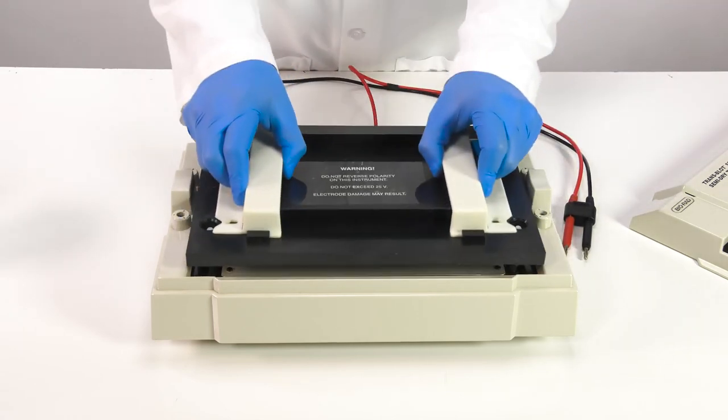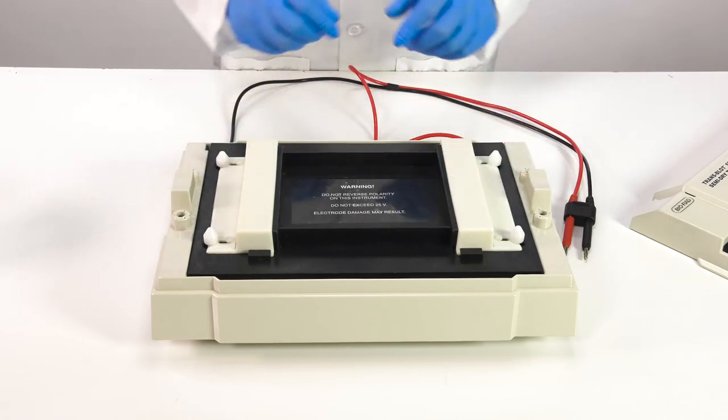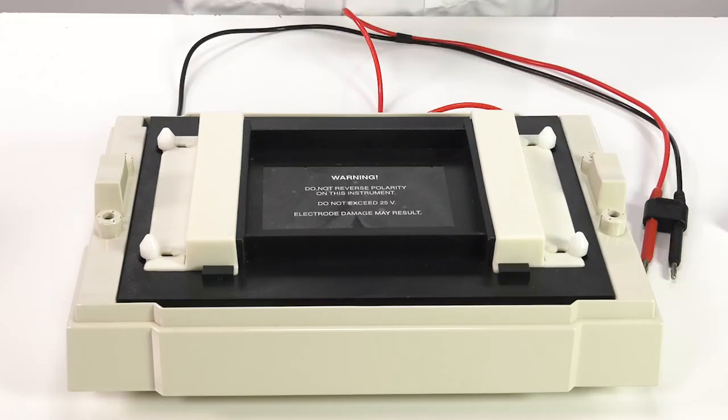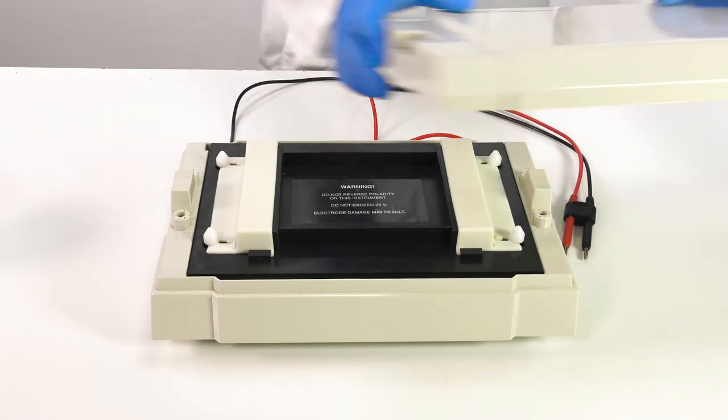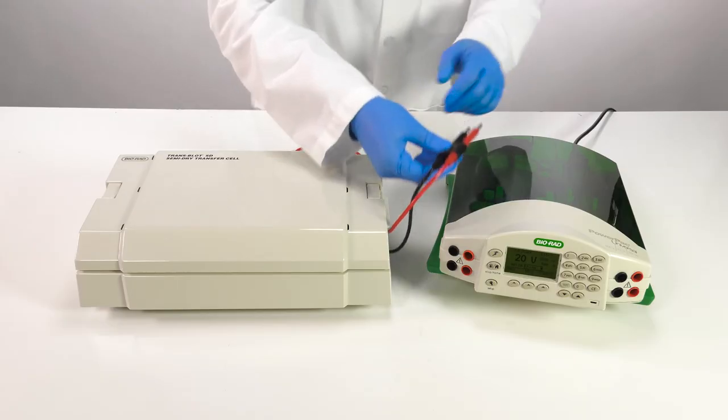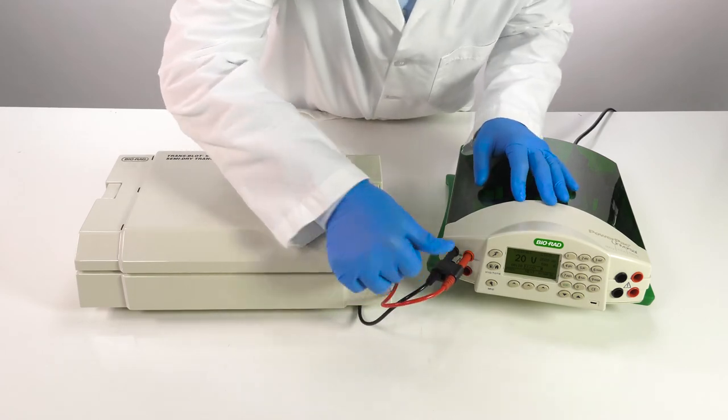Carefully place the cathode onto the stack. Press down to engage the latches with the guideposts without disturbing the transfer stack. Place the safety cover on the unit. Plug into the power supply and begin your transfer.